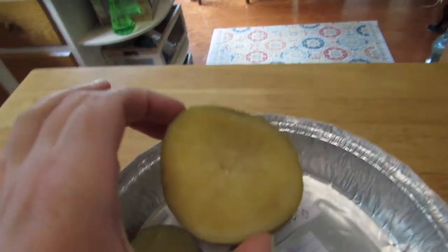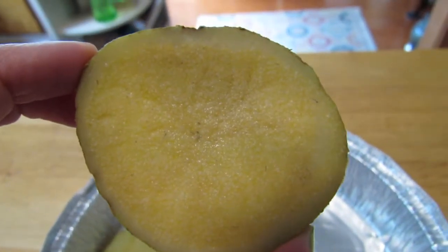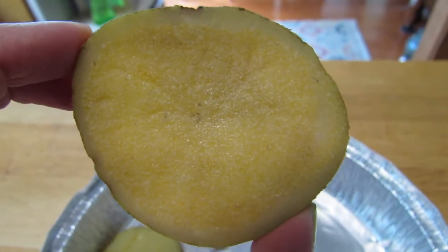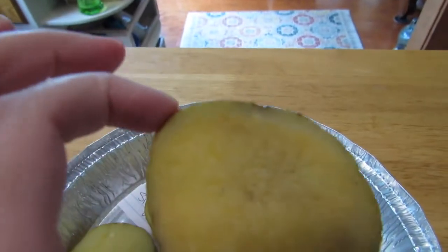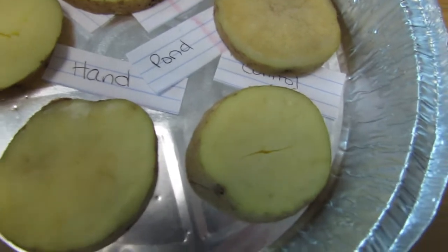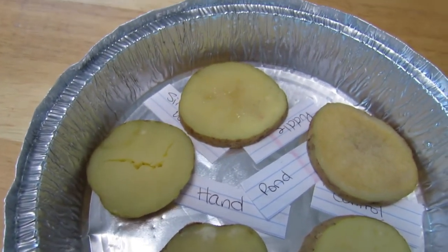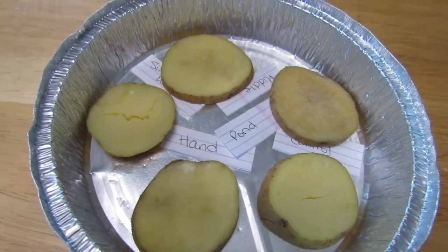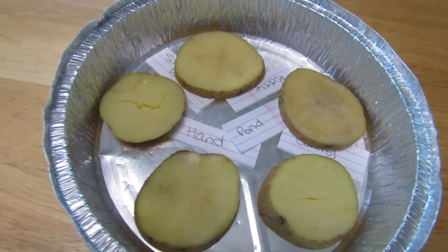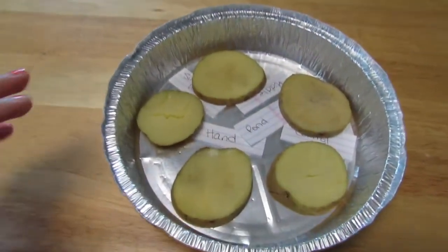And this one is the best one — this is the pond. All those teeny tiny dots, each of them is a colony of bacteria. And there are some dark spots too, which means we must have found a bunch of different species of bacteria in the pond, which is so cool. So pretty much: my control didn't have much, my hand had a little, the sink water didn't have much which was good, the puddle had a lot, and the pond had a lot. I'm so happy this actually worked and I hope it works for you. This is like the old, old-fashioned way to study — what they did before they even really understood what bacteria was. Science Corner with Constantine. Do it for science.